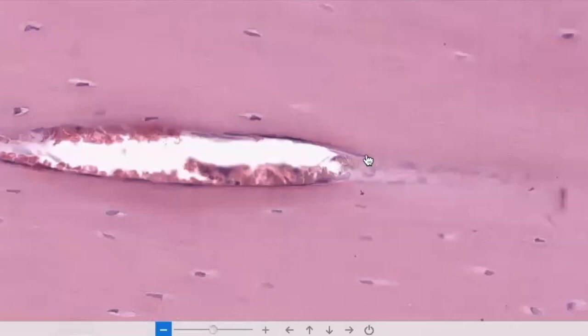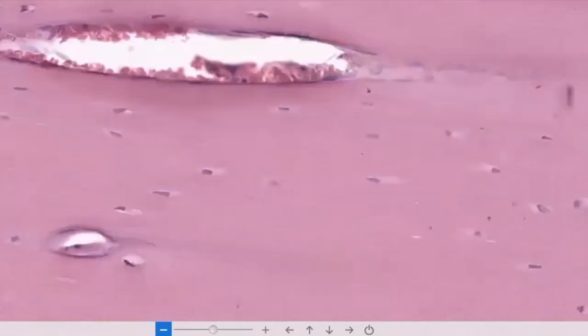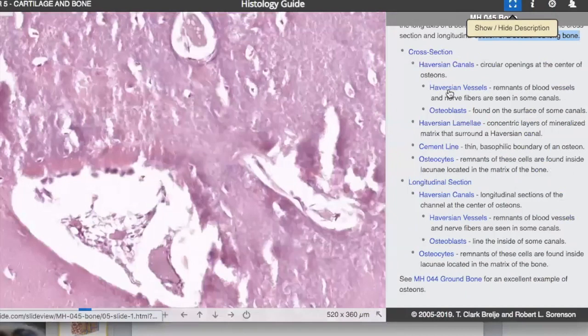The structure, like any of the shapes and sort of fine detail, you can't really see in the sample at all, right? So this kind of looks a lot like cartilage, like hyaline cartilage almost, with the exception that this has blood vessels running through it. Cartilage is completely avascular. So if you see blood vessels, that means you're looking at bone tissue, even if it's something that looks like this. Okay, so here's one sample of bone, and then the cross-section view is going to look a little more something like this.